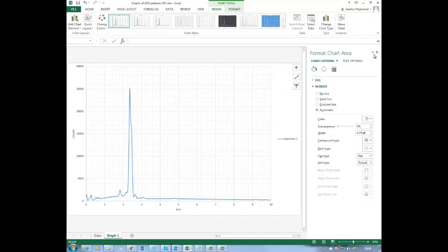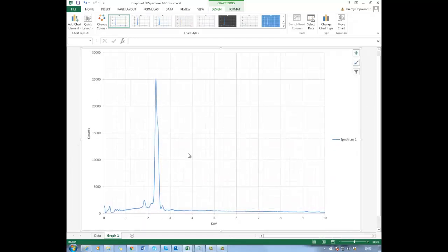And all I'm going to do now is add on all the other spectra. They will overlap. So stage 1 is get them all in the graph, even though they're overlapping, and then step 2 is to copy this graph and then to move the graphs stepwise so that they're no longer overlapping. So I'm going to get the second one in.